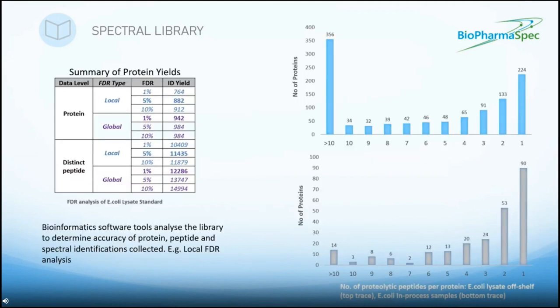So I've got a couple of examples in this slide to demonstrate a few points about library types. At BPS, we do like to dedicate project time to generating a library and to ensure that it's as broad as possible, and that it just gives us greater confidence in the low-level HCPs during data processing and review.